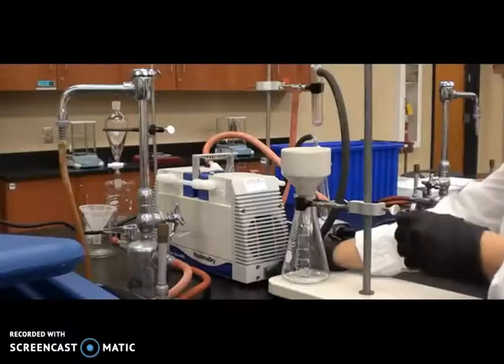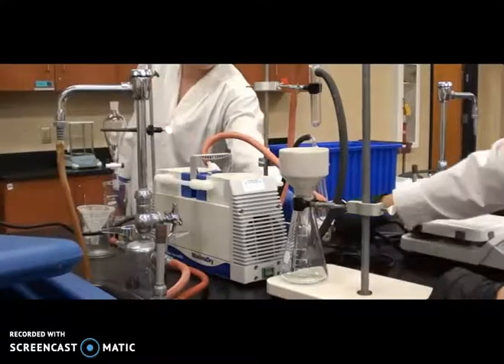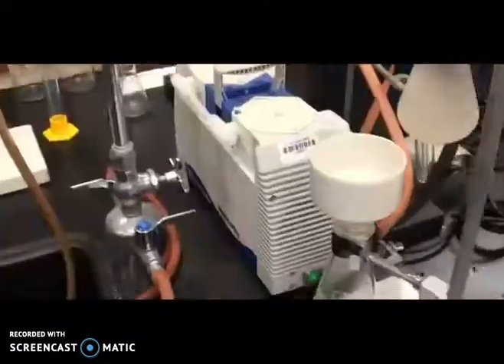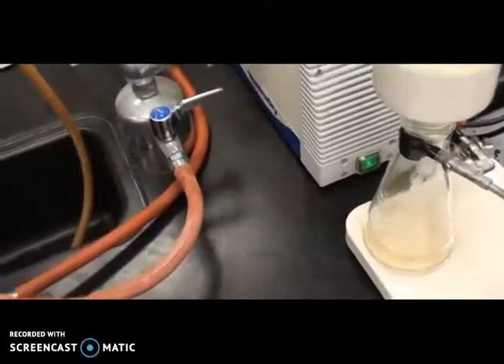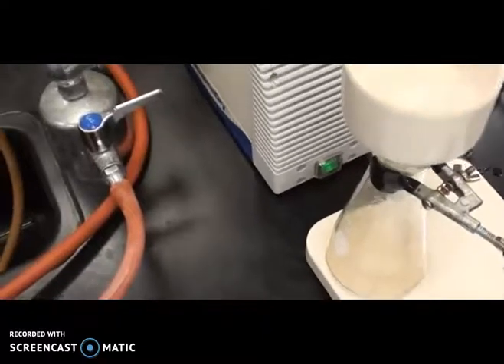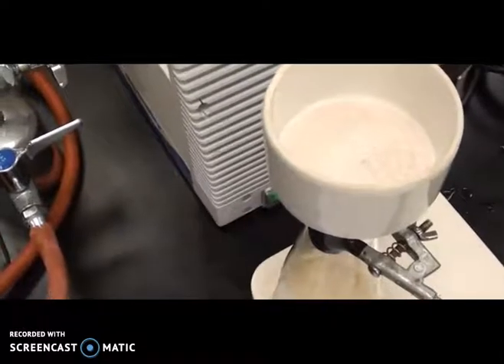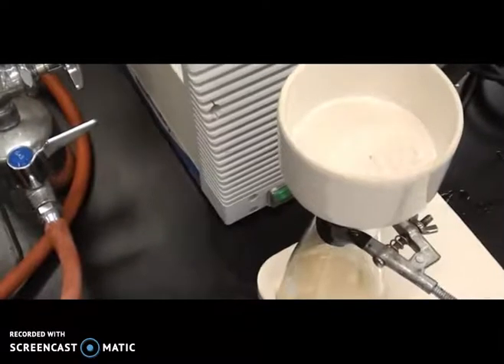Now you put it in ice and then do the filtration. After filtration you will get the product. Now you can see the filtration is going on. You see the filtration under suction and you will get very nice crystals of acetanilide. This is the compound you want to prepare.